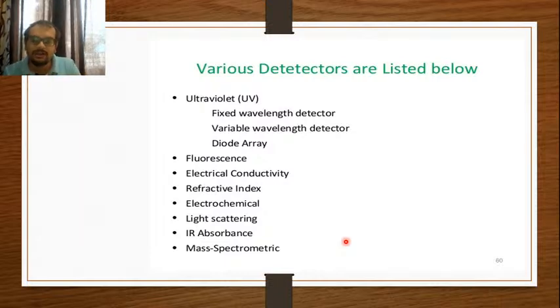So in the start you are dealing with 10% methanol, you may increase it to 20, 30, 40, 90% depending upon the elution process. If you are going to change the composition or strength of the mobile phase, then that case is called your gradient elution system.